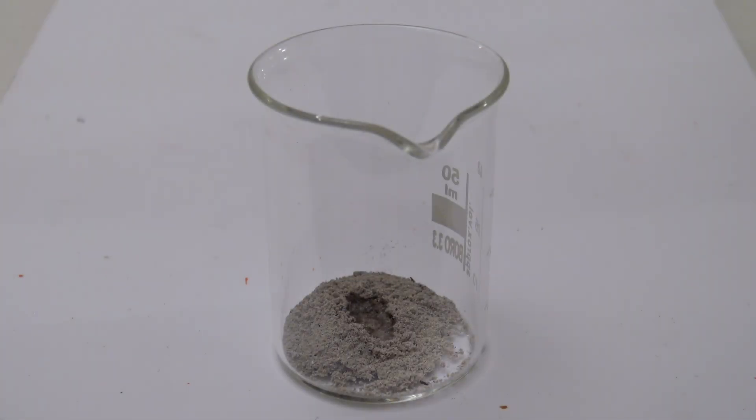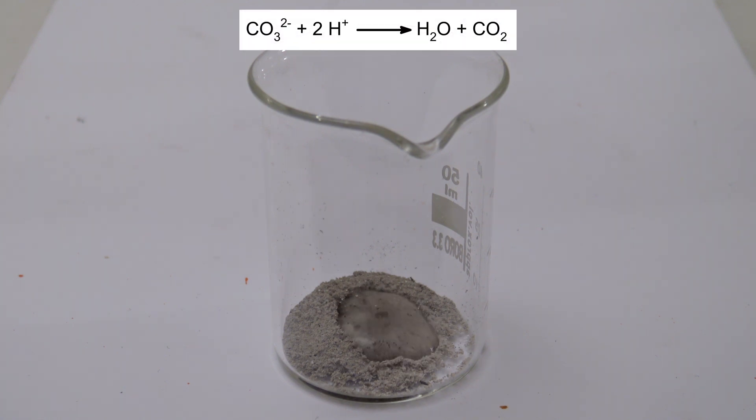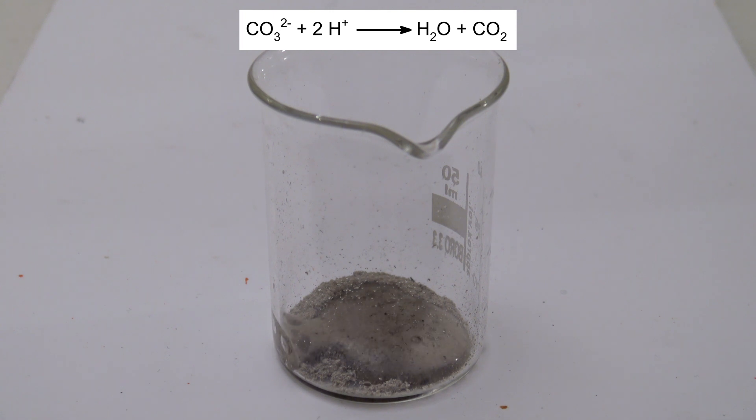When acid is added to wood ash, the formation of gas is obvious. A large portion of ash consists of carbonates, so the gas should be CO2.